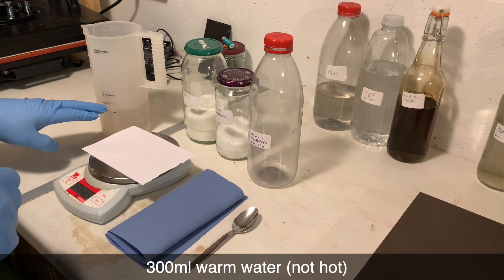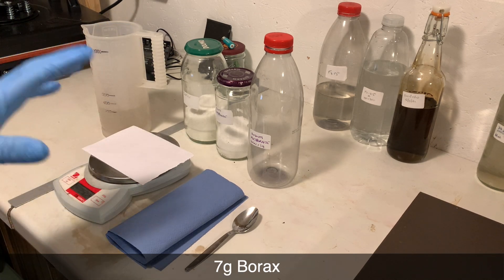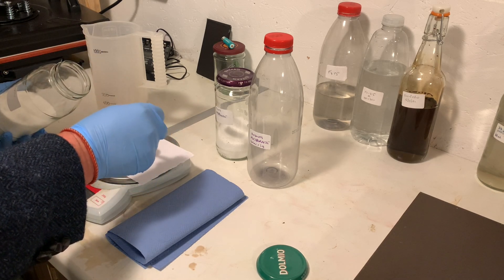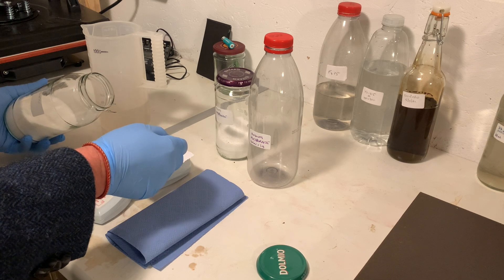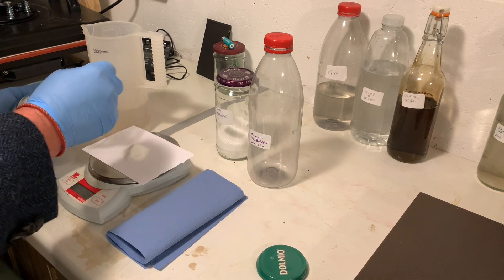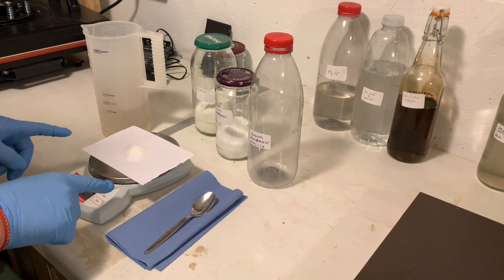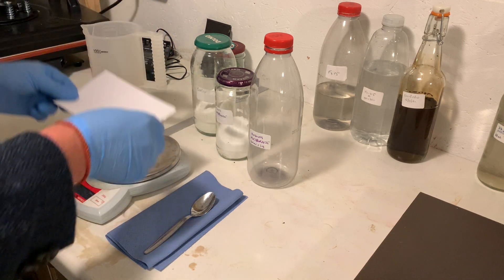I've got just over 300 mils of warm water here and I'm going to first add the borax. What I need is 7 grams of borax. Now, borax doesn't dissolve very well in water, which is why we need quite a bit of water for it to work. So let's first measure out our 7 grams. Make sure you do this in a well-ventilated room or outside, and you can see I'm wearing gloves, especially because of the sodium hydroxide. So there's 7 grams of borax and I'm going to put this in the warm water and dissolve it.